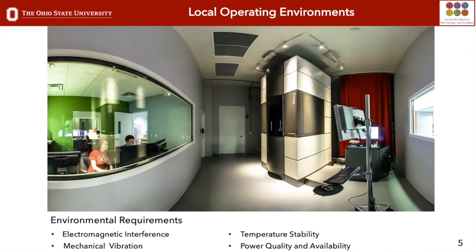But these environments are necessary for these two microscopes. And so the data you'll see today and the work you may want to do, part of what makes it really possible is the facility that we're in and the effort that was put into reducing the perturbations in the facility.